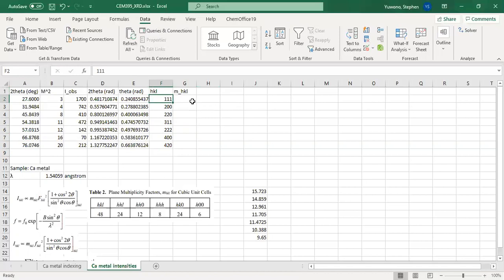So it will add to the intensity. That's why, for example, here we have 2 possible signs for each of the ones, and we have 3 ones, so that's going to be 2 times 2 times 2. That gives us 8, which is exactly what we have here.